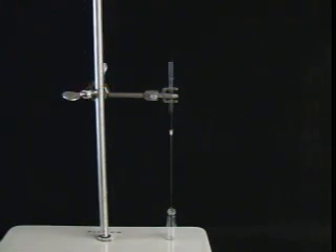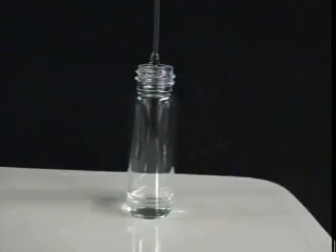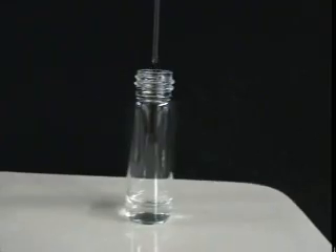Look down at the tip of the filter pipette. The filtered liquid should be draining out into your collection vial. Our once-black mixture is now clear when filtered.